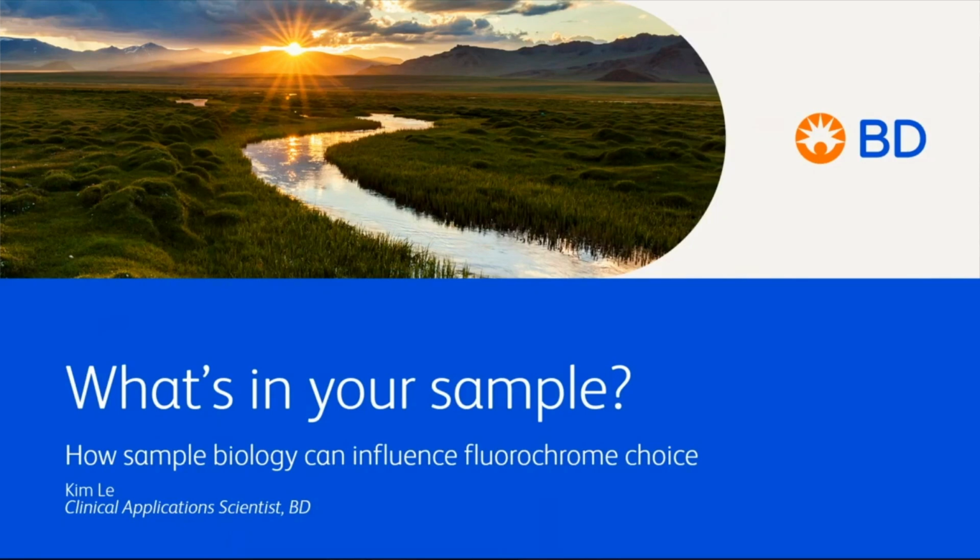And once you have taken the sample biology and fluorochrome considerations into account, the third talk will cover how to standardize your assay for reproducibility and how to troubleshoot existing panels in your lab. So please make sure to register for all three webinars in this panel design educational series.